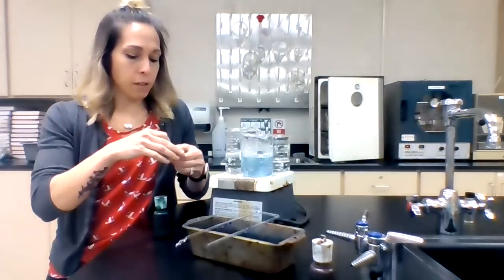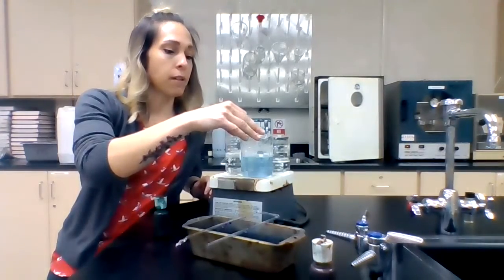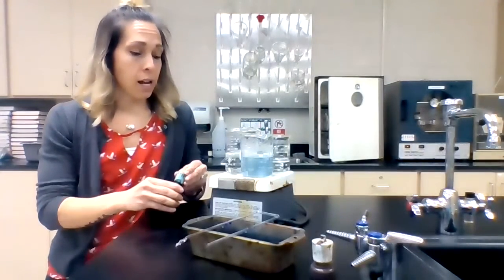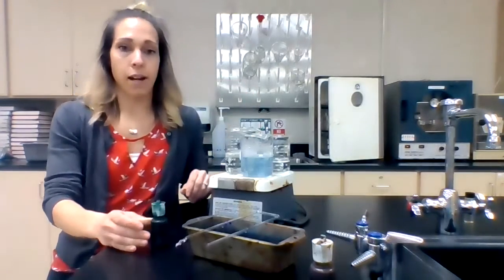You're then going to come over to the station with the beakers that are full of hot water, and they should be steaming. And I'm going to very carefully put it there on the edge. And the steam is what's going to help. You're going to take your malachite green and you're going to put a drop or so on the paper towel sitting on your slide until it's saturated.